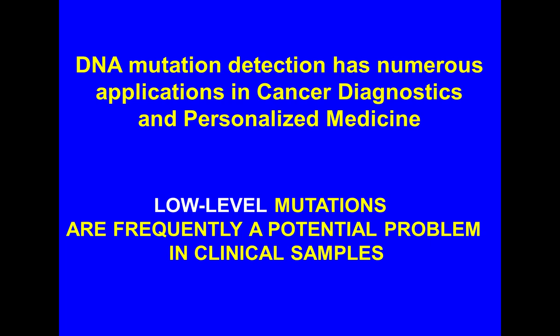So, mutation detection, as we all know, has numerous applications in cancer diagnostics and personalized medicine. These low-level mutations are very frequently a potential problem in clinical samples.